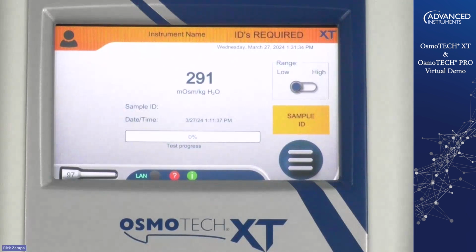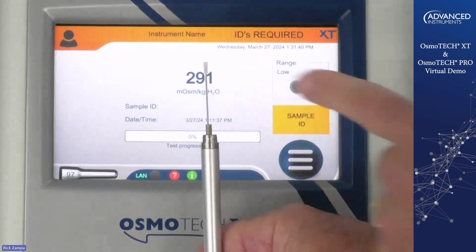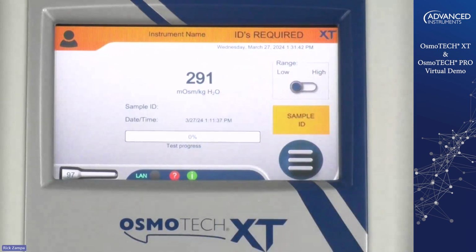We would recommend rerunning the test, ensuring your sample volume is good and there are no bubbles, and your result should come back into range. Perfect. The point being that handling of the sample, pipetting, cleaning in between tests, and avoiding air bubbles are critical when testing osmolality on these devices.